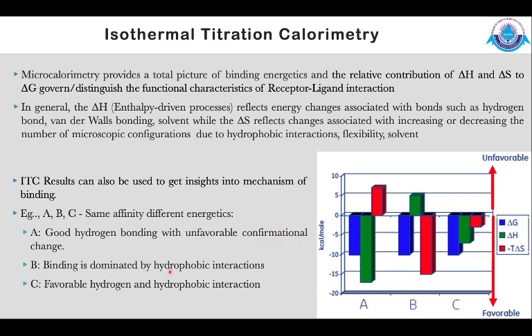On the other hand, in the second case, the binding is predominantly hydrophobic in nature, and does not form any hydrogen bond or van der Waals interaction. However, it has a strong hydrophobic interaction. In the third one, it has both hydrogen bonds and van der Waals interactions, and probably also has a preferred orientation.